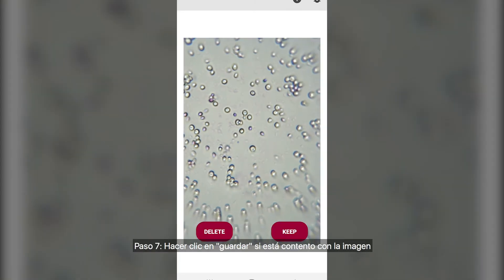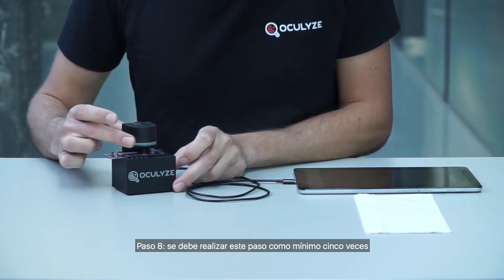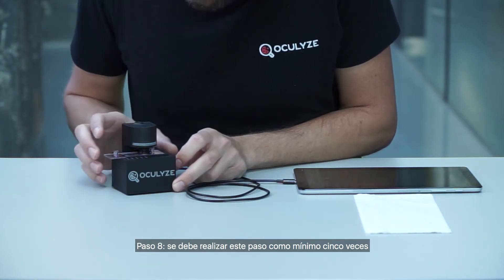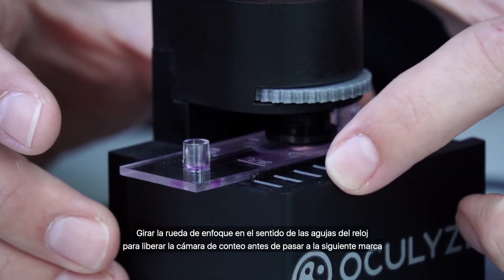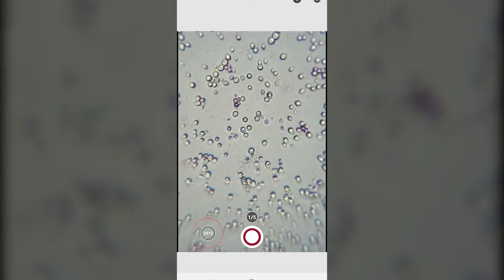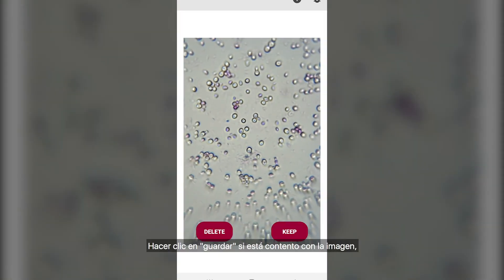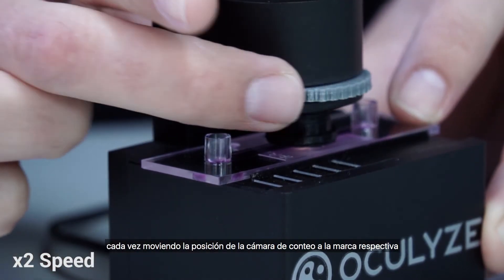Step 7: click Keep if you are happy with the image. Step 8: you must conduct this step five times. Turn the focusing wheel clockwise to release the chamber before moving into the next marking. Click Keep if you are happy with the image each time, moving the position of the chamber to the respective marking.